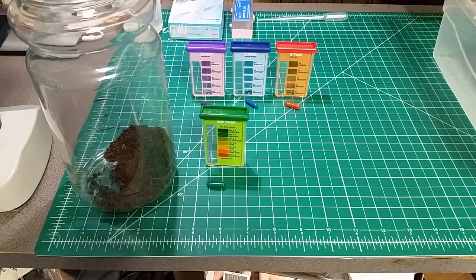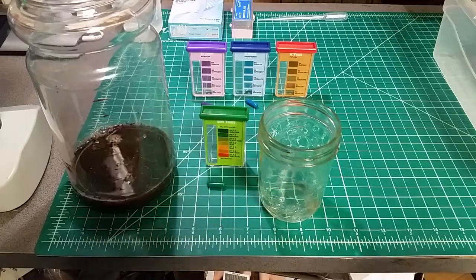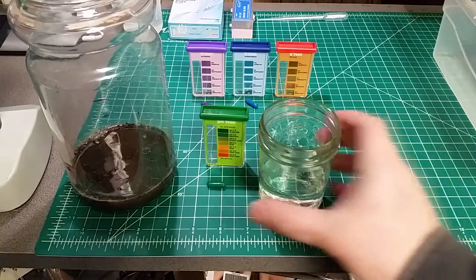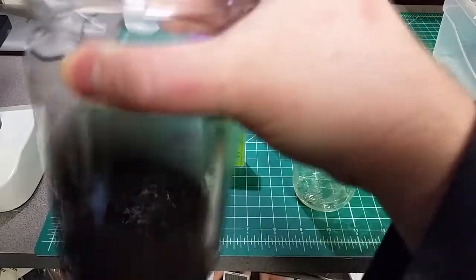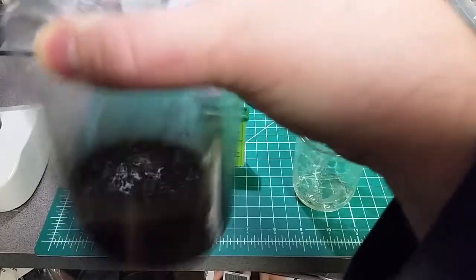Different testing kits and methods will have varied requirements, but this one will take the longest because we have to wait for the solids in the solution to settle out. I'm adding water in stages — adding 150ml, then 100ml — holding to that ratio as best we can. We mix this up to wash off all of the water-soluble nitrogen, phosphorus, and potassium off of our particulate. Once we're satisfied with the stirring, this gets set to the side to settle.